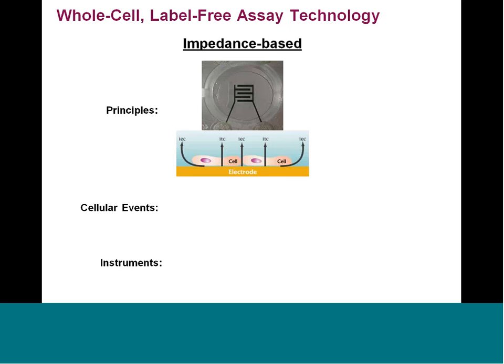A second important starting point is that the current that's applied between the two electrodes is exceedingly weak. The point is not to excite the cells. We don't have any evidence that it excites the cells. It might, but there's no evidence of that. Really, the only point is to apply a small enough current to find out what the path of the current between the electrodes is.